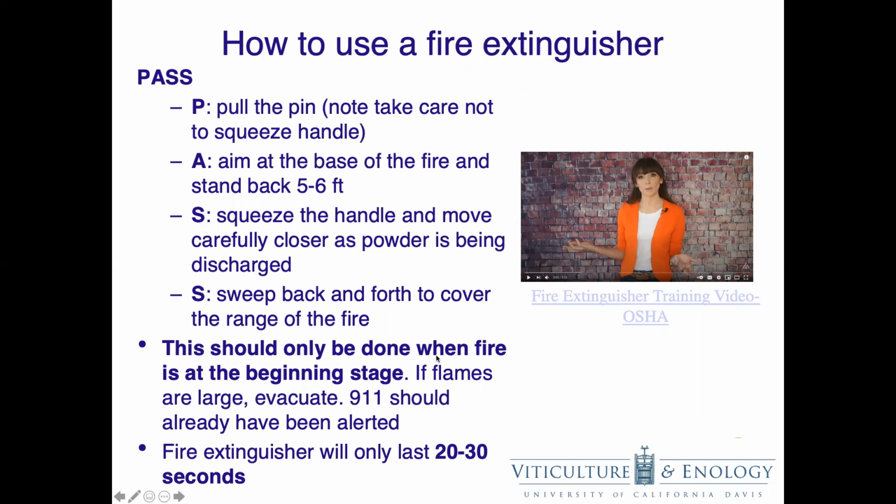This should only be done when the fire is at the beginning stage. If flames are large, evacuate. 911 should have been alerted as soon as the fire started. Keep in mind, a fire extinguisher will only last 20 to 30 seconds.